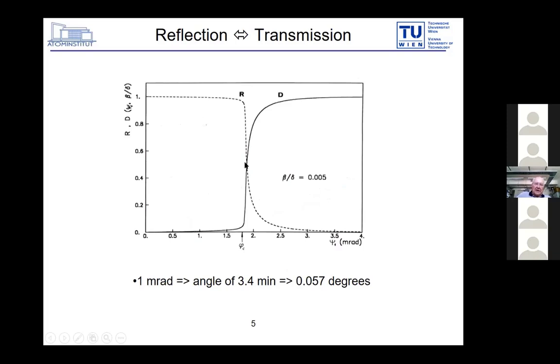The reflectivity below the critical angle, in this case, is for molybdenum characteristic radiation on a quartz. It is about 1/10 of a degree. And you see that in the range below, you have a very, very high reflectivity and almost no penetration. This results in a very low background. Above the critical angle, we have the opposite. Reflectivity is practically zero and transmission is full.